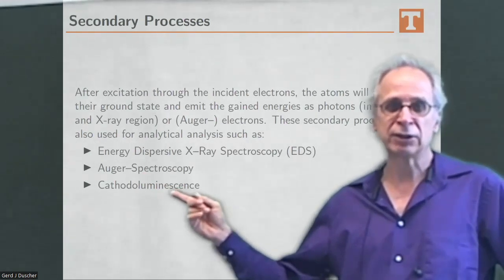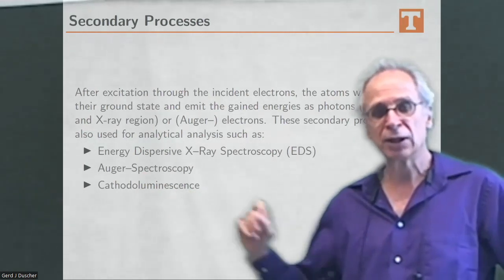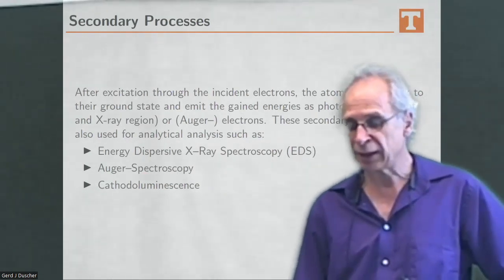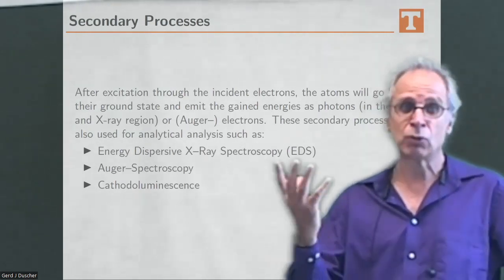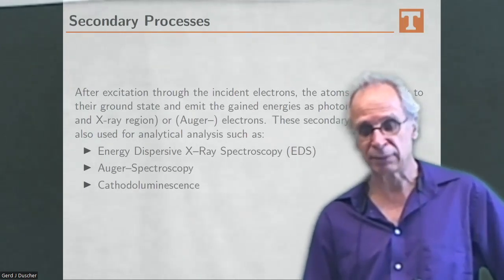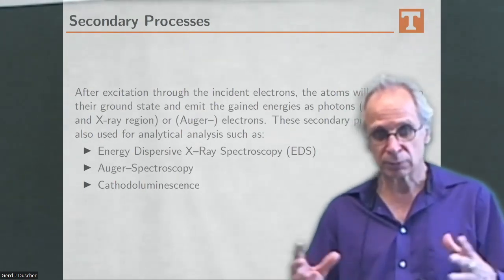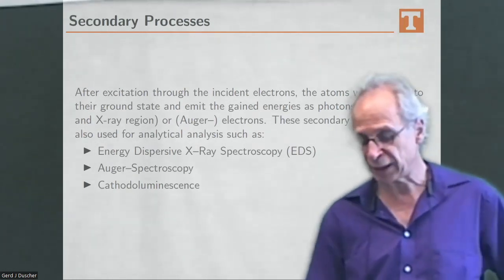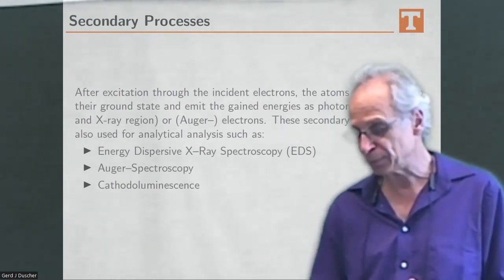This is certainly still in its infancy. It's used much more in the SEM part. So in a TEM, we don't use it that much. So it's a little bit esoteric. Again, this will change. The easier it becomes available, the more it's going to be used. And then I hope in the next few years, we will see more of the different techniques or the different signals being collected. And then we have to figure out how do we combine them, right? So that's what we do.